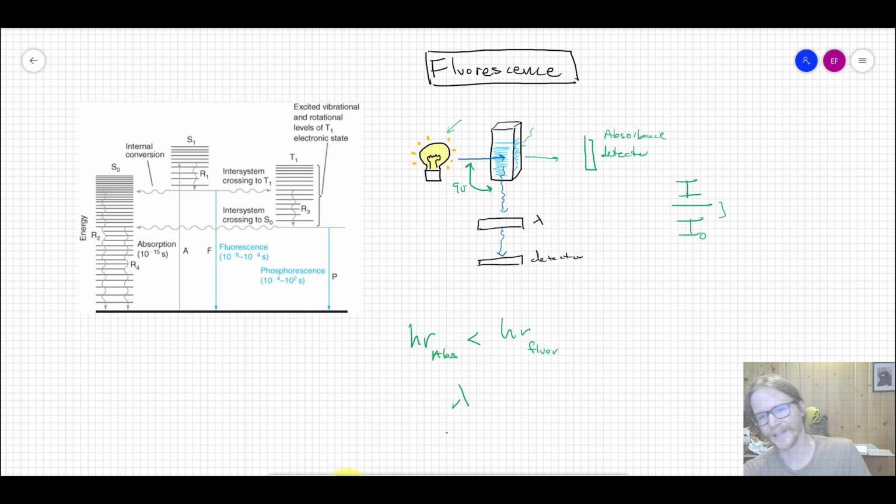we're measuring a small difference if you have a very small amount of analyte. In the fluorescence geometry, because it's emitting a distinctly different frequency, completely different than the source light, and it's emitting those things rather than simply absorbing them, think about all the molecules inside here that are absorbing this light and then proceeding through a fluorescence decay mechanism. They're emitting light isotropically in all directions. Right? So it doesn't matter where we place our detector, whereas with absorbance, it has to be directly in line with the light source. So we have this isotropic emission of a light frequency that's different than our initial source, so that allows us to decouple our detected frequency from our input frequency of light.